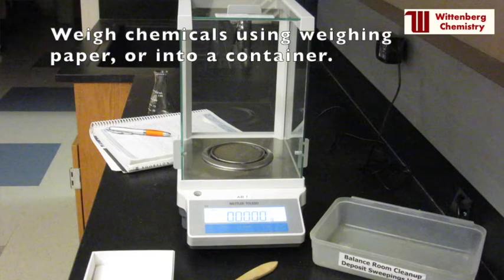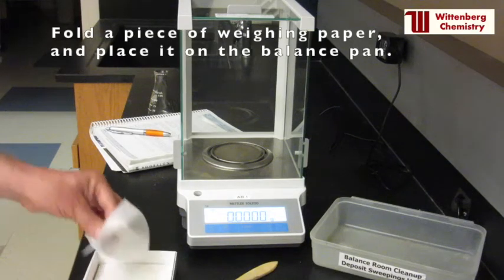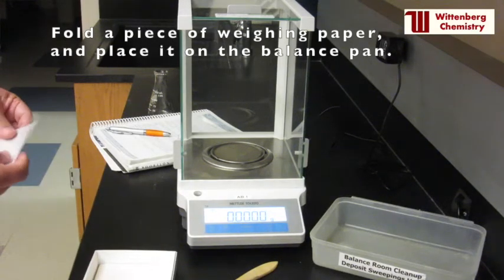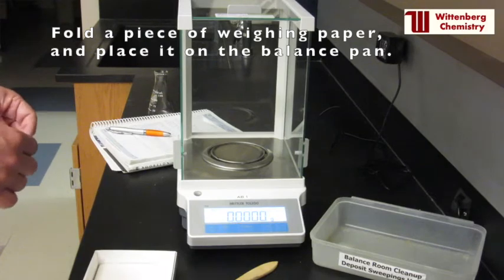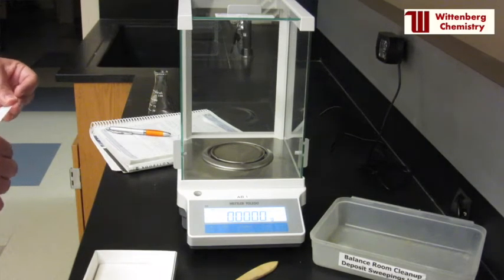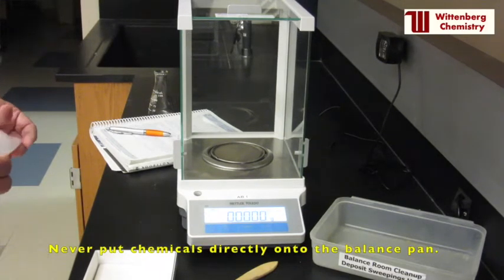Solids should be weighed onto weighing paper or directly into a container. This video will show you how to use weighing paper. Fold a piece of weighing paper diagonally, slide open the balance door, and place the weighing paper on the balance pan.